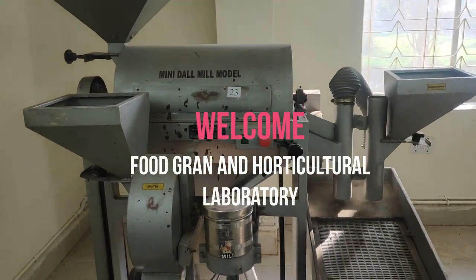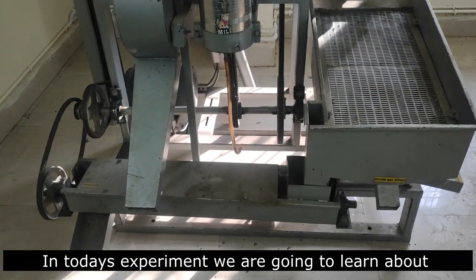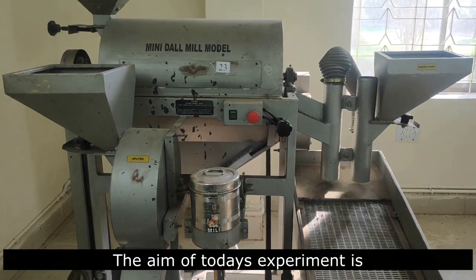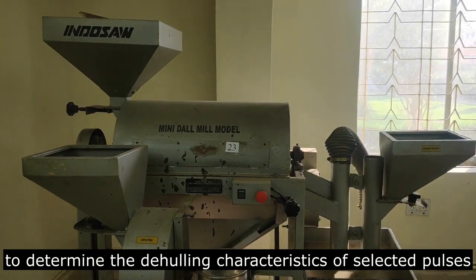Welcome to the Food Grain and Horticultural Processing Laboratory. In today's experiment we are going to learn about the de-hulling characteristics of selected pulses. The aim of today's experiment is to determine the de-hulling characteristics of selected pulses.